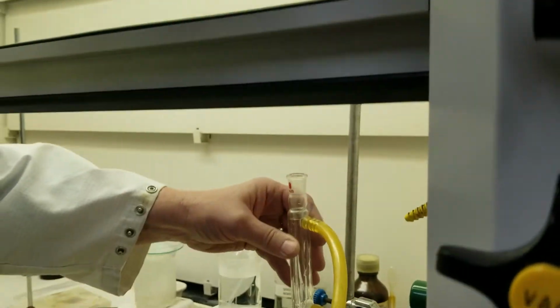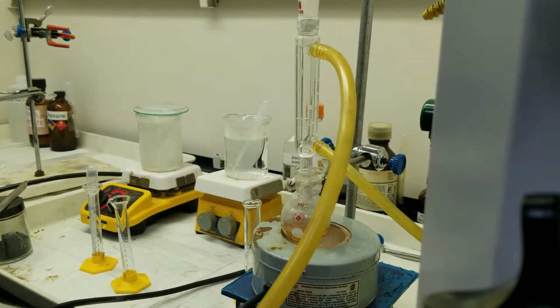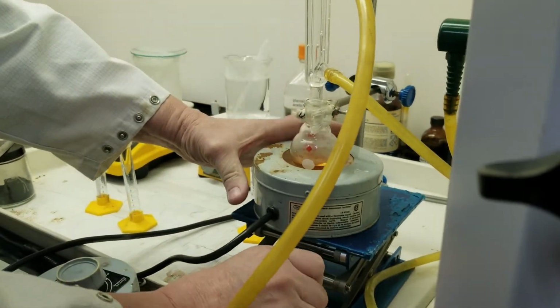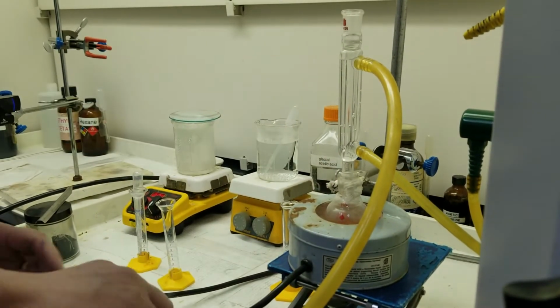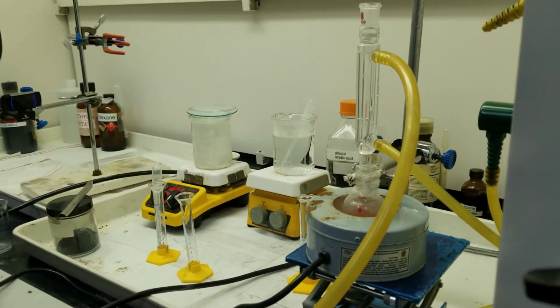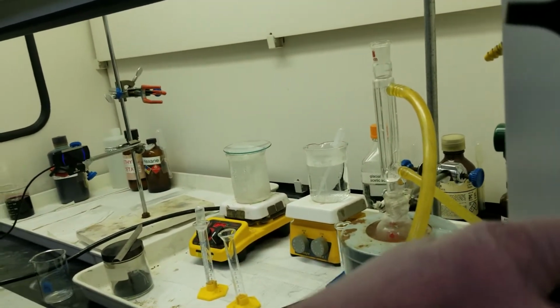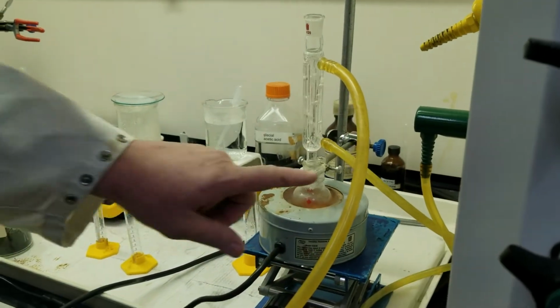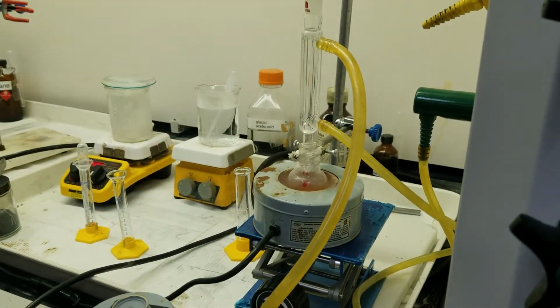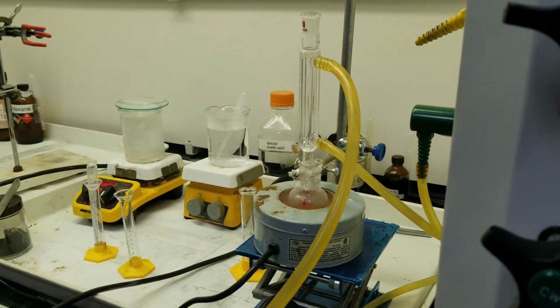We are now going to put our joint on, which I previously greased. Make it airtight. Raise the thermal well, and we're going to reflux this for about an hour. So, oftentimes in labs like this, I would have students do the setup first, then I'd lecture on it because of the waiting time. There's a huge waiting time on this one. So we have our water running. It is mandatory. You need that to keep the water cycling. So that'll reflux.